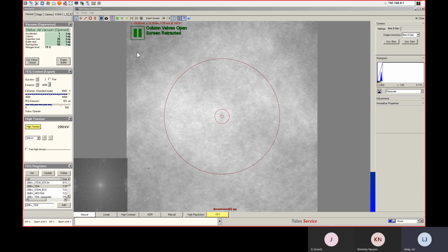Okay, tomorrow we're gonna focus on the diffraction, all different kinds of diffraction technology. We're gonna simply go through nano diffraction in the TEM mode and the STEM mode, and then we're gonna go through convergent beam electron diffraction in the TEM and the STEM.